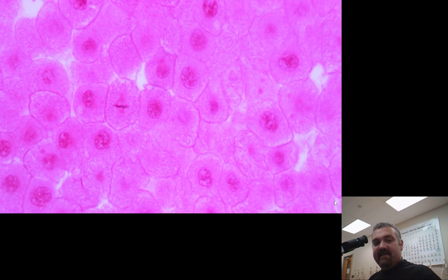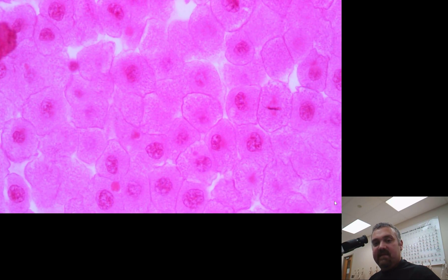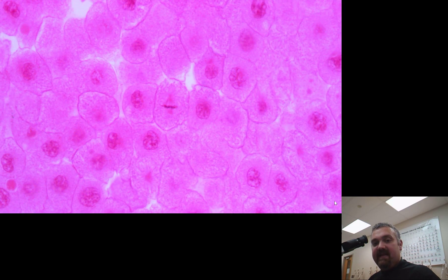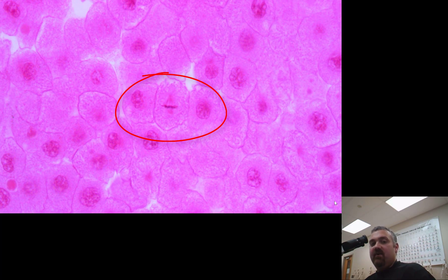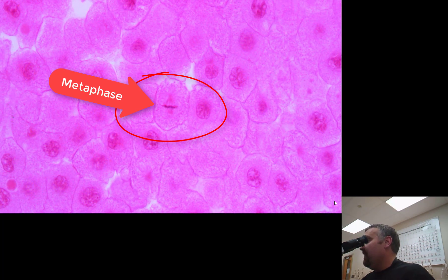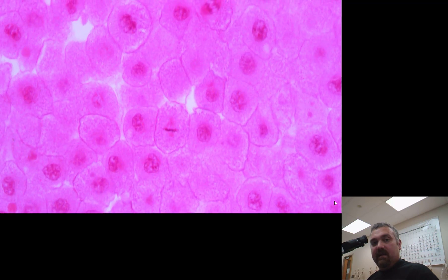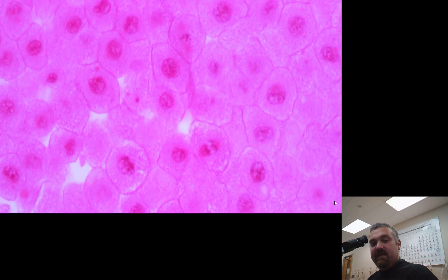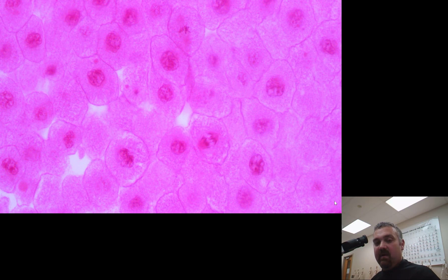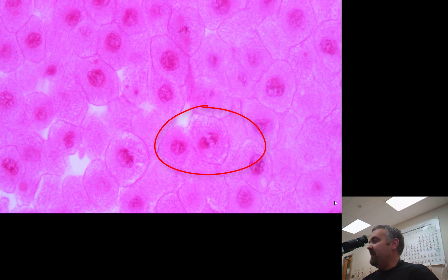Let me kind of center it. Right there in the center, we see the chromosomes lining up at the equator of the cell, as I like to call it. And if I go back a little bit higher, you can see there, chromosomes being pulled apart.